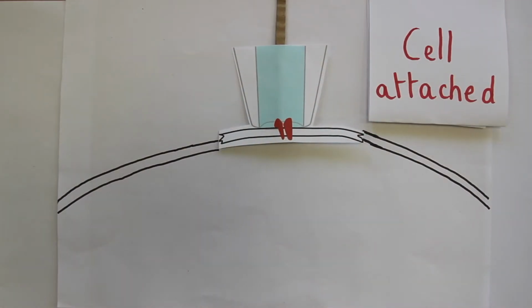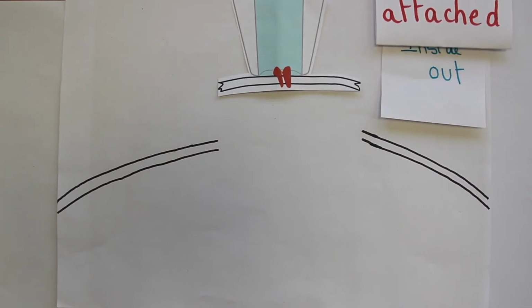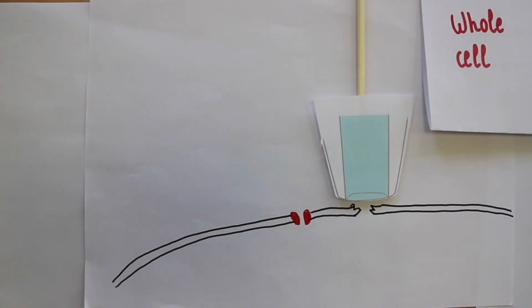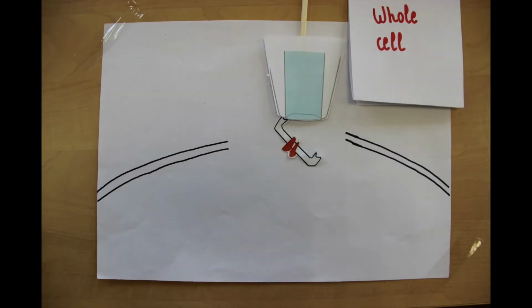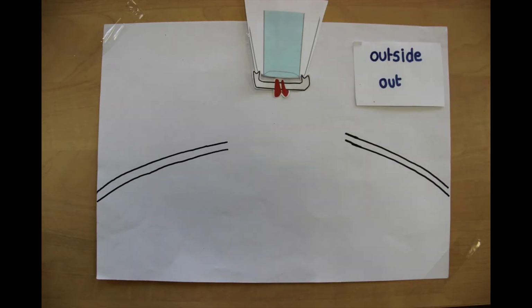When using the inside-out configuration, we pass through the breaking of the cell membrane to remain with only a fragment of the membrane. The intracellular surface is exposed so we can play on the intracellular medium. When it comes to the outside-out mode, we start from the whole cell configuration. And when retracting the pipette, a fragment of the cell will reform itself in the pipette, giving us access to the outside of the cell. Those last two configurations make us able to study a limited number of channels.